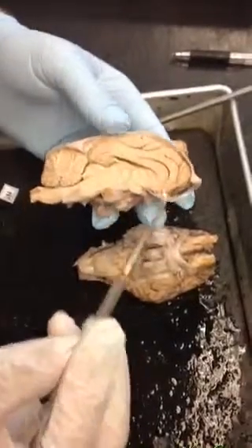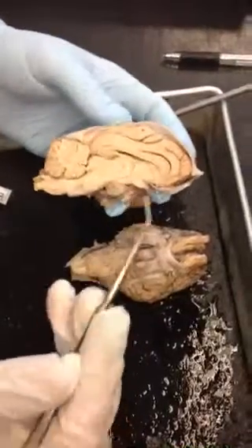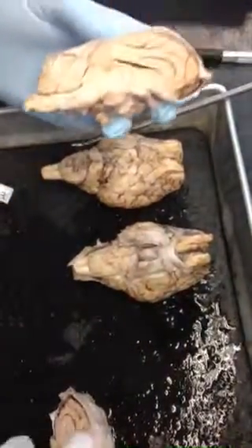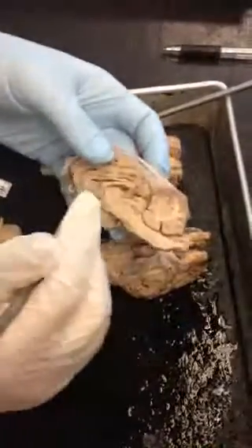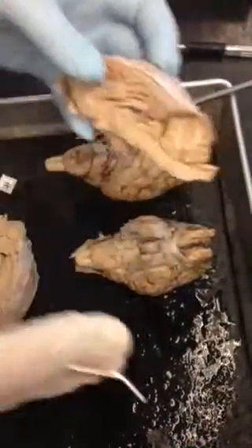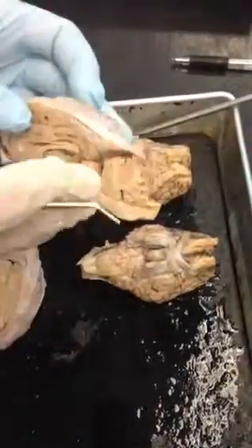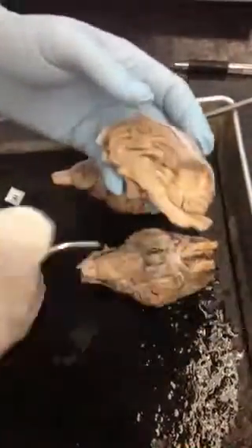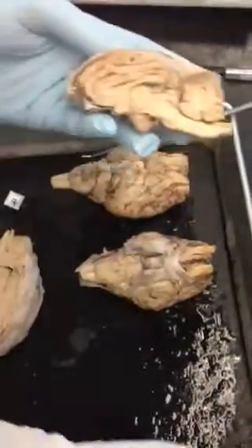The septum pellucidum. We can't see it. Well, it depends on how the brain's cut, but a lot of times you're not going to be able to see it. It's a thin membrane that separates the left and the right ventricles, so it's in the middle between the two. It's just a thin membrane, and it goes like this. So depending on how these things get cut, a lot of times you can't see it.